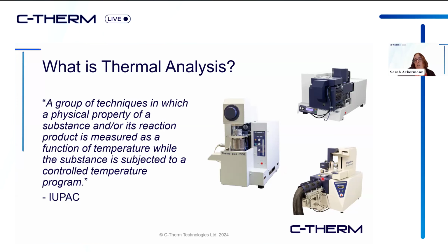And then over here, we also can do simultaneous thermal analysis, which will study weight and this temperature difference between the sample and the reference side as a function of temperature and time.